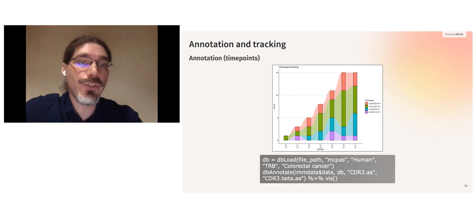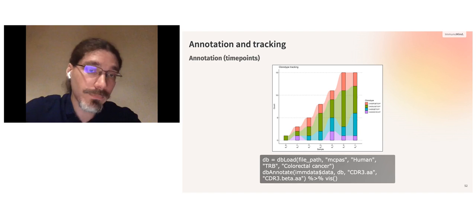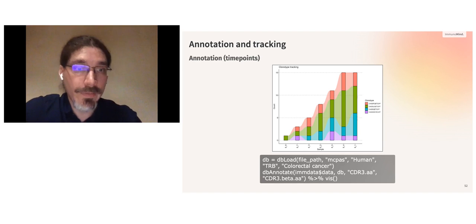So here we want to annotate the immune repertoires using CDR3 amino acid sequences.